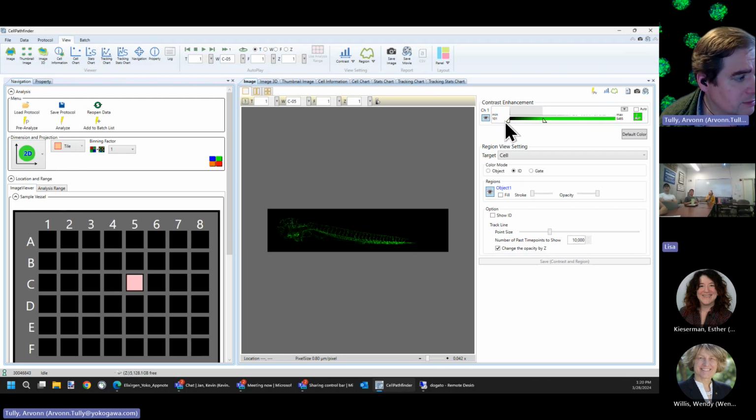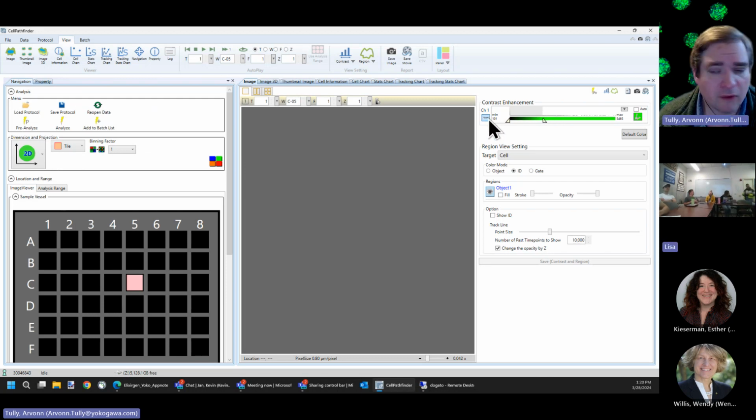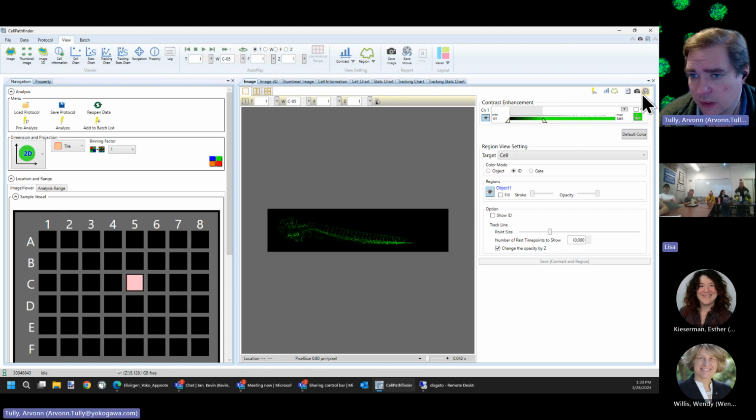Yes, no? Yep. Okay. It doesn't change the data. All it's doing is changing how the data appears on the screen. So it makes no difference to the actual data, makes no difference to any of your segmentation or analysis. It doesn't change anything, but it makes it easier to see. And you can turn it off or on. So anyway, that was the second most important thing.